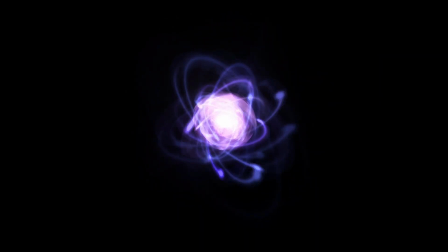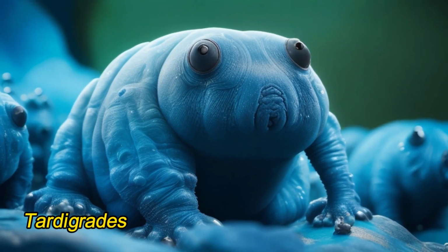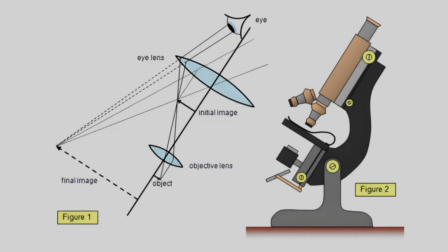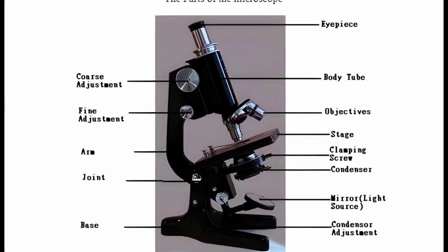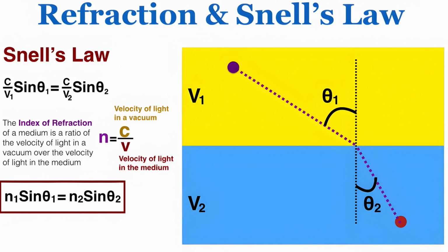At the core of this optical wonder is the principle of magnification, a process that transforms minuscule specimens into intricate landscapes of detail. It all begins with the objective lens, a precisely crafted glass masterpiece. As light passes through, it bends, converging onto the specimen, rendering it larger than life. This bending of light, or refraction, occurs due to the differences in optical density between the glass and the surrounding air, a phenomenon described by Snell's law.